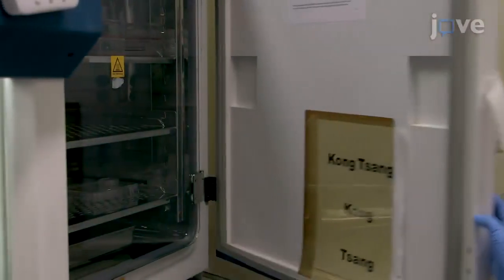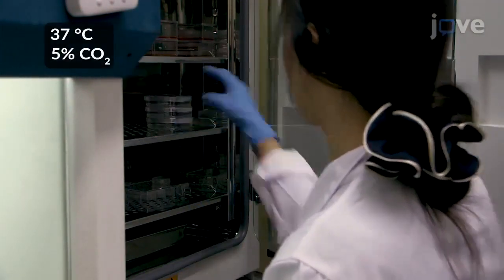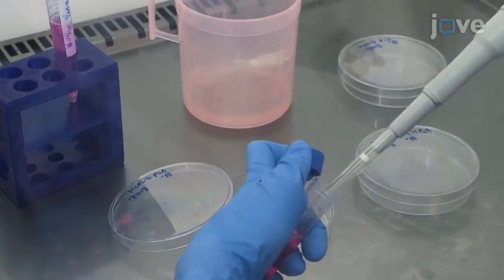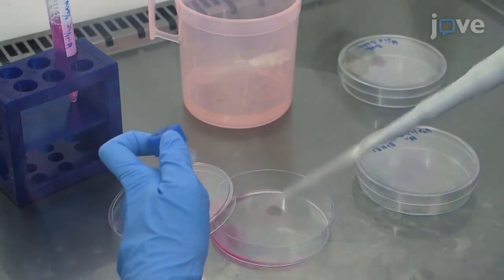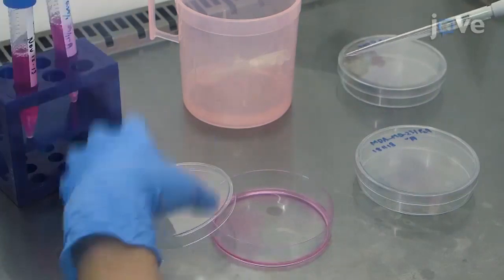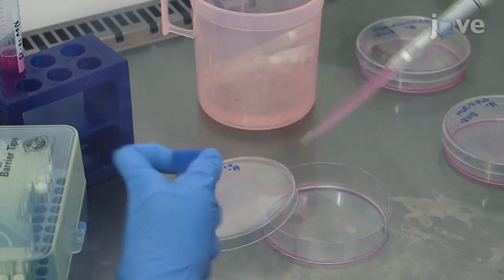To begin, culture MCF-7, MDA-MB-231, and T-47D cells according to the text protocol. After this, wash the cells with PBS twice. Then add 2 mL of 0.05% trypsin EDTA to the MCF-7 and MDA-MB-231 cells, and 2 mL of 0.25% trypsin EDTA to the T-47D cells.